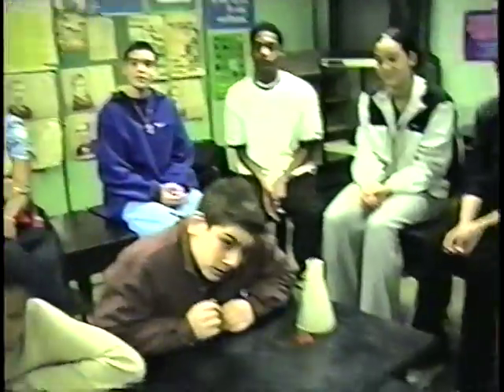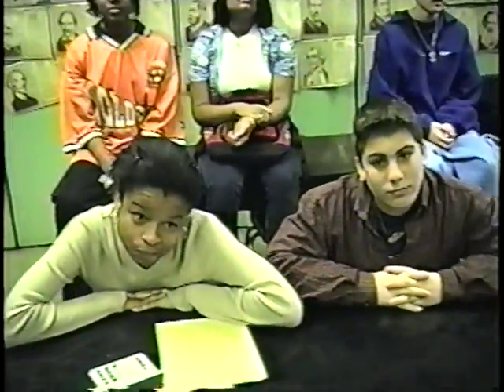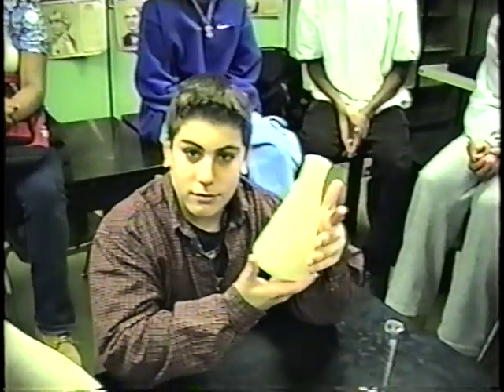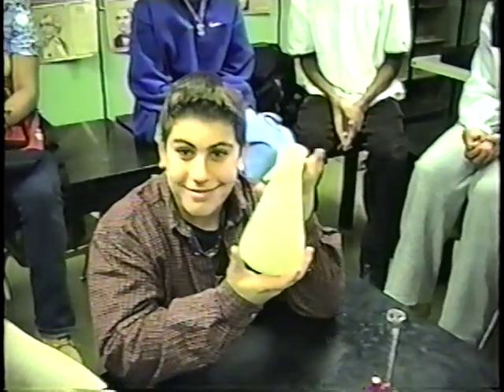Okay, now, it's not a math class, so we're going to try to figure out the volume in a different way. What do we call the way that we're going to try to figure out the volume? There's a special name for it. H2O displacement. Say it loud. Water displacement. And in order to do that, we have a piece of equipment over here that we haven't used before. Who can tell us what the name of that equipment is? You got the overflow part. Overflow flask. Who can say that 3 times quickly? It's a tongue twister. Overflow flask, overflow flask, overflow flask.